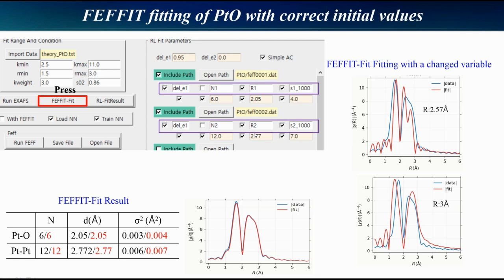The fitting results are shown in two figures. As you see, the fit result did not agree well with the expected values, highlighting the importance of having accurate initial values. These results can make it challenging for beginners to conduct EXAFS analysis.